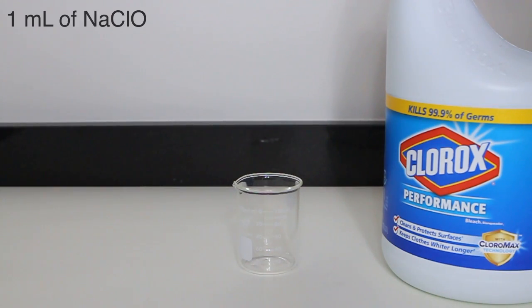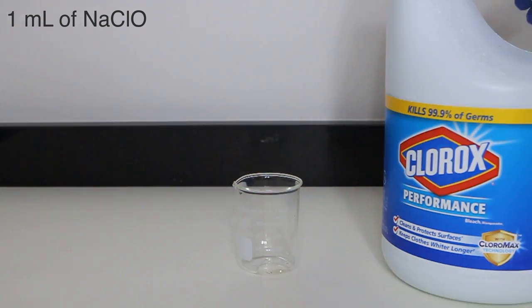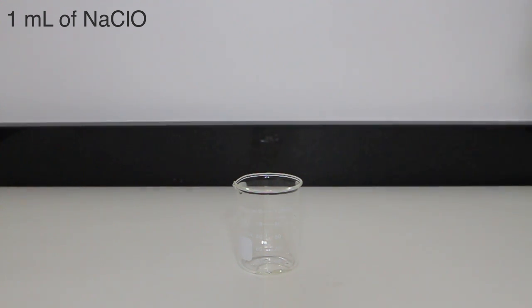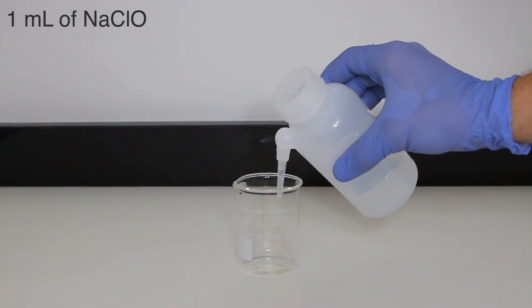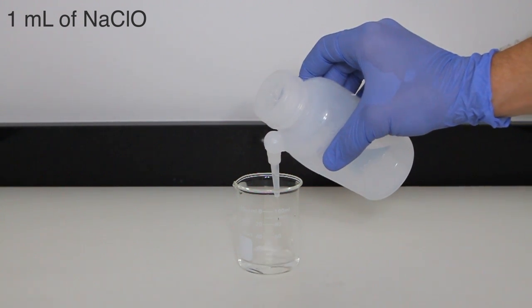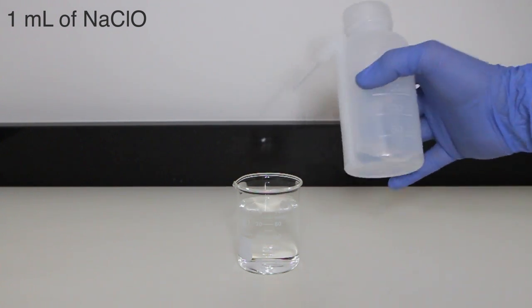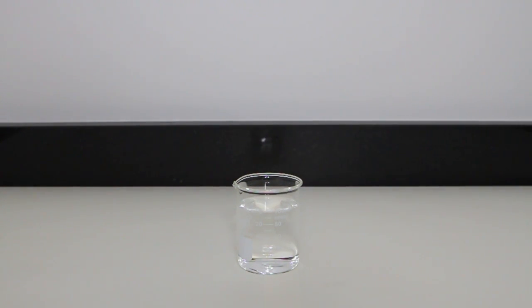Moving on to the second solution, 1 milliliter of bleach is added to a clean 100 milliliter beaker. With the bleach added, distilled water is then used to dilute the solution to 100 milliliters. The volume of the two solutions must be equal when combined. With the volume of the second solution up to 100 milliliters, we are ready for the reaction.